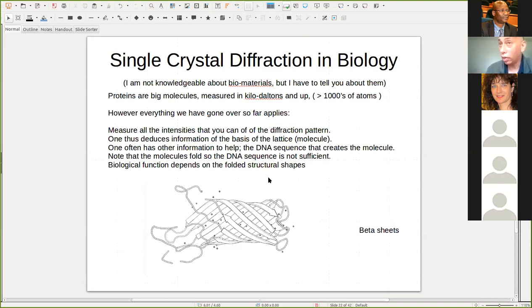I have to say I'm in awe that these crystallographers are able to solve these structures. If you've done a few simple ones, you have a lot of respect for people who do this kind of work. But they do have some things that help them. For example, they have something called a protein database, and every time somebody solves a structure, they put the structure in. And as you know, nature reuses many, many motifs in many different places. So collectively, I think it gets easier as they go along.